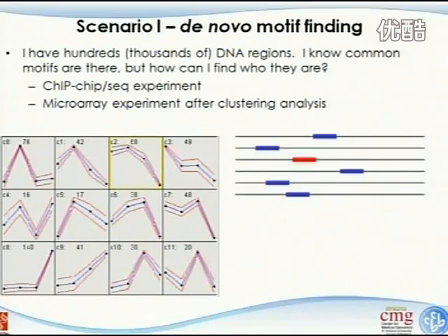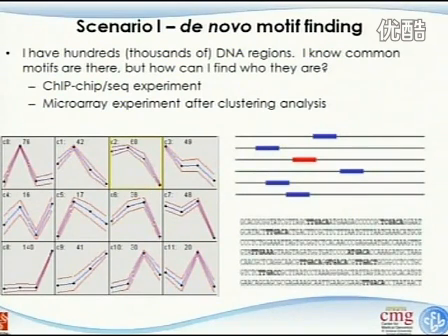And it's not really an easy task to do if you look at the problem in this way. So these are the ACGT sequences you identified from ChIP-seq, and the bold ones are the real binding sites. If they are perfect binding sites, like AACCGT, that's straightforward and a little bit easier, and people still can do it. But we know that for motif finding, there's a degeneracy there. So at one location, if there's a one-letter or two-letter mismatch, it can still be a binding site. And at that stage, using something simple really doesn't help too much.